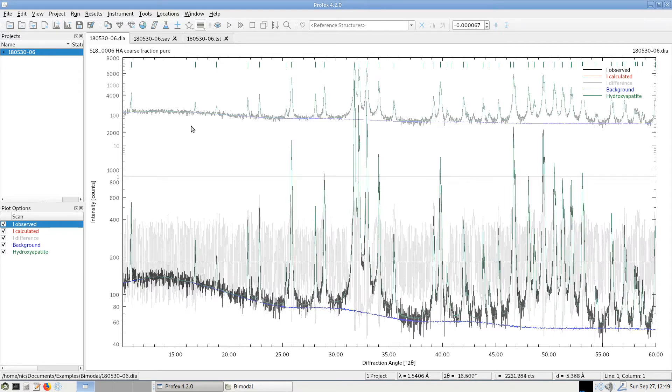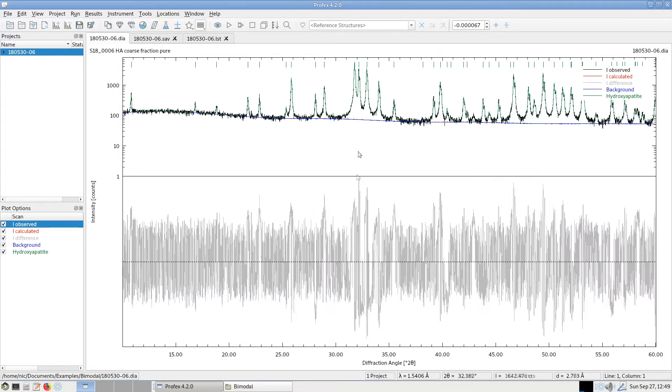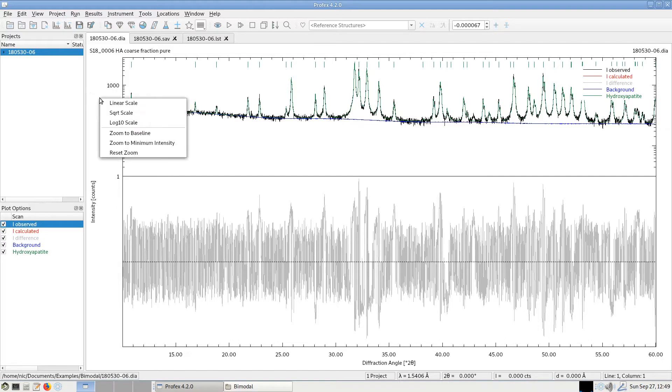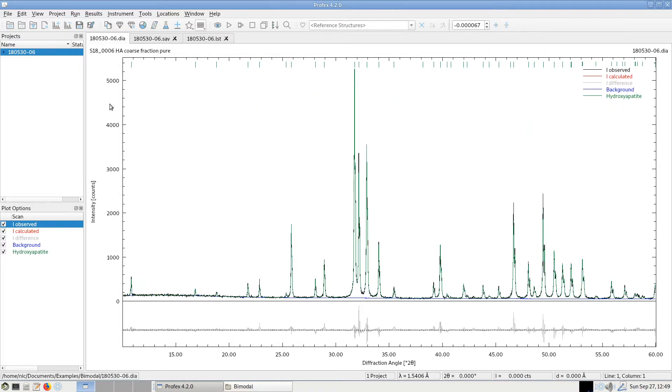If we right click, it will use the full zoom range again. And these quick zoom actions also work in the linear and the square root scale. Using the right mouse button resets the zoom value again.